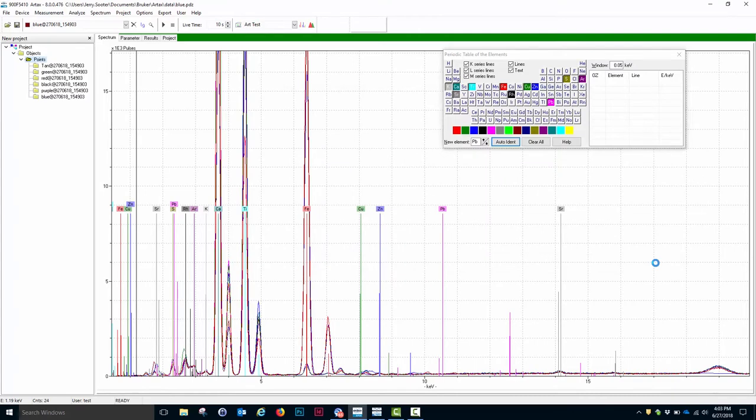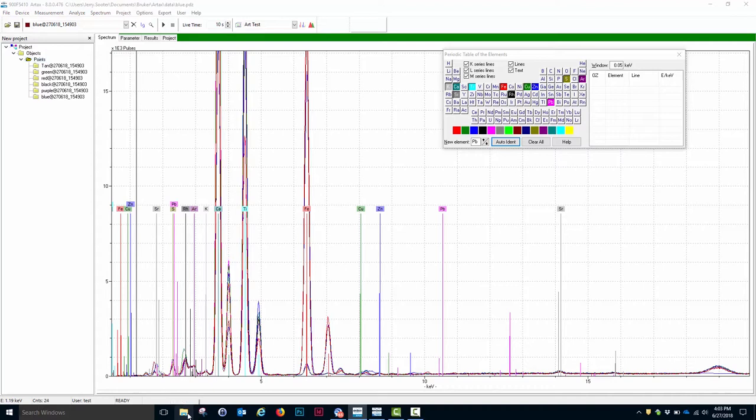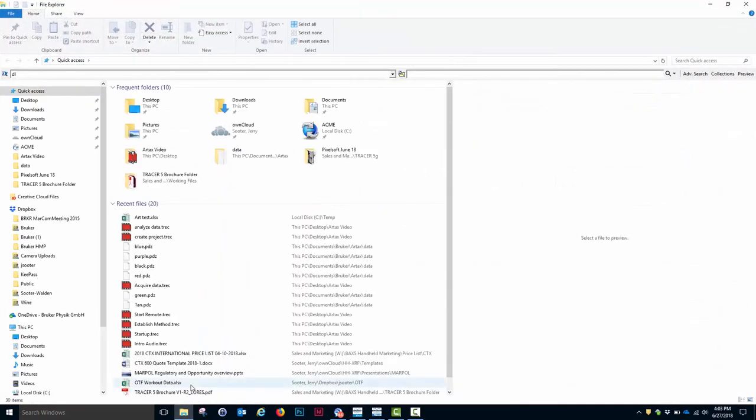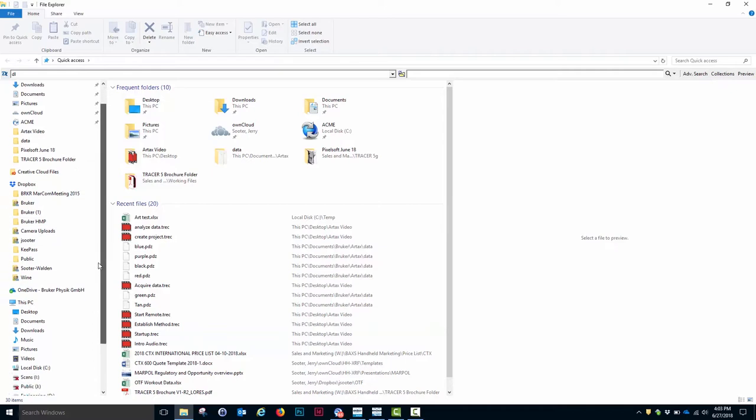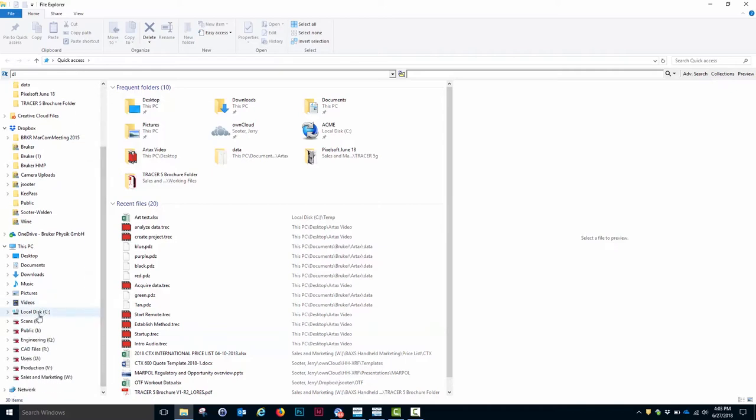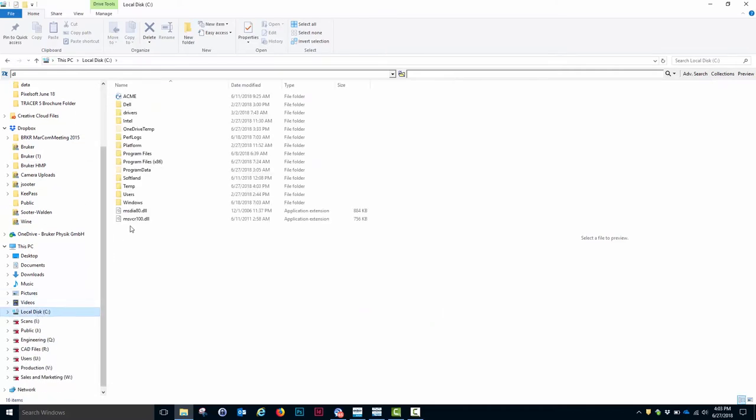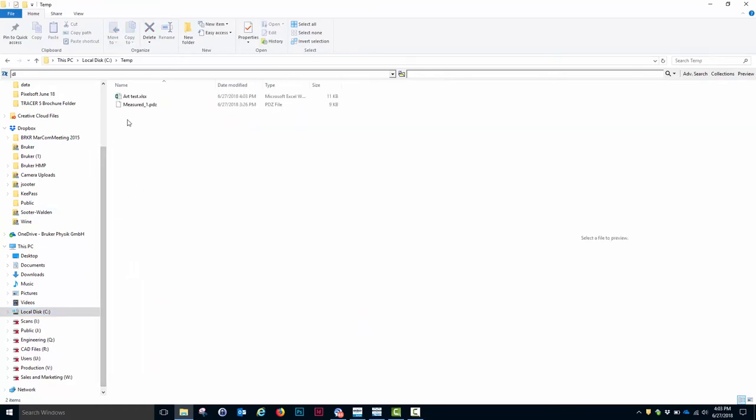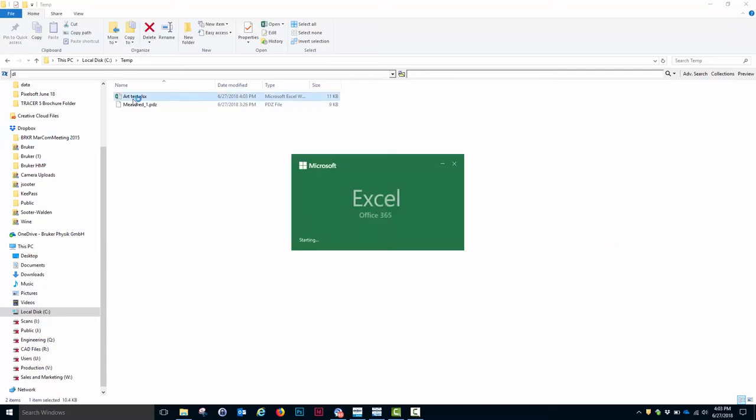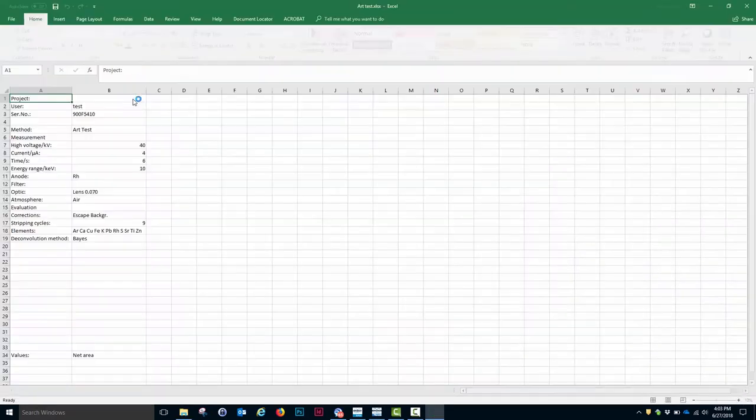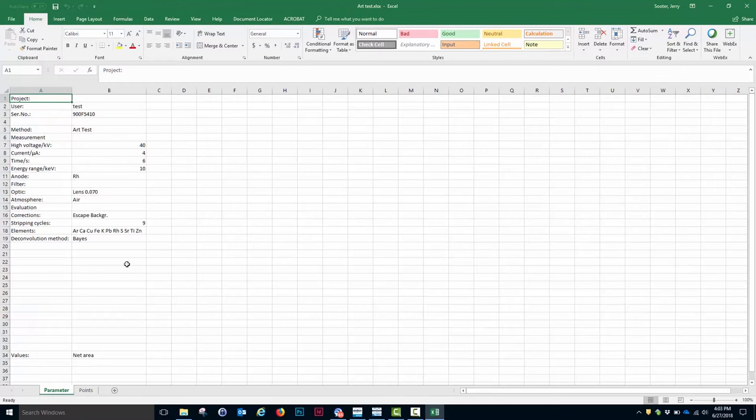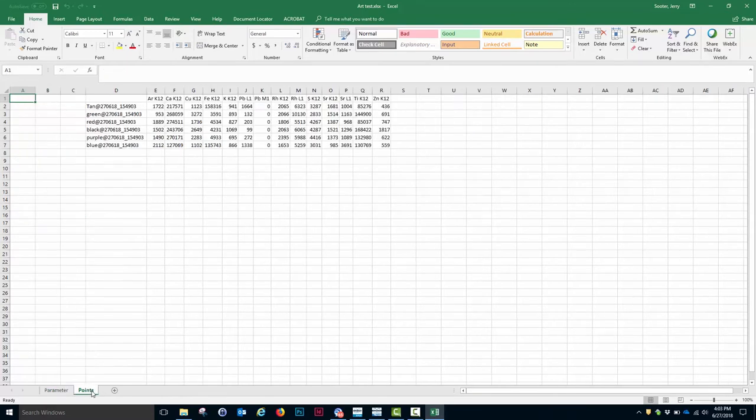That should have saved the data in an Excel format with the net intensities for each element in each of the spectra. If I now go to the File Explorer and go to Drive C and go to Temp, I find my Art Test Excel file. And in this case, when I open it, what I have is I have two sheets. The first sheet contains all of the parameters from the data acquisition. The second sheet contains the net intensities for each of the elements in each of the spectra.